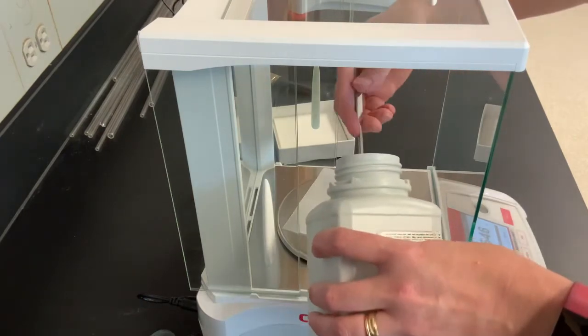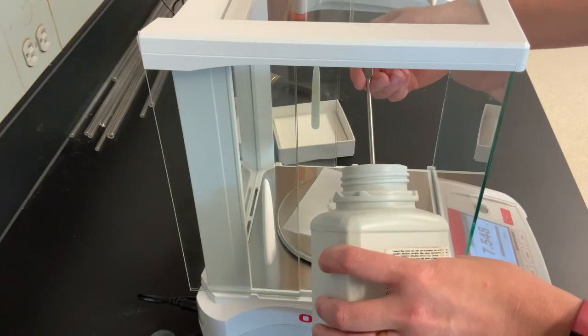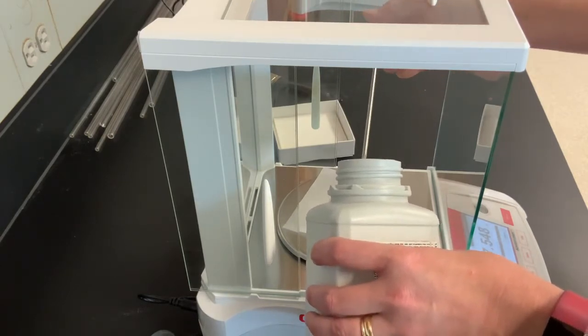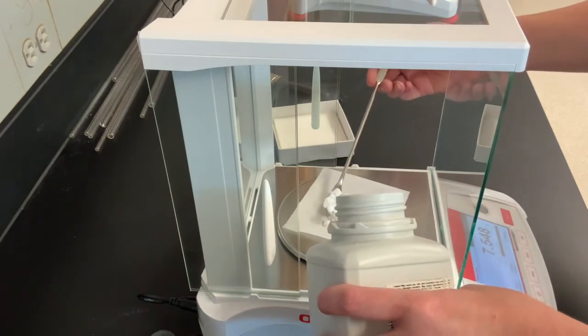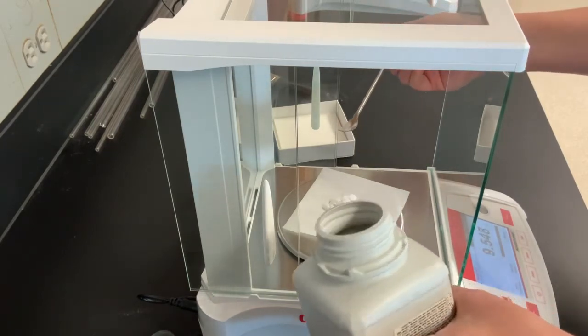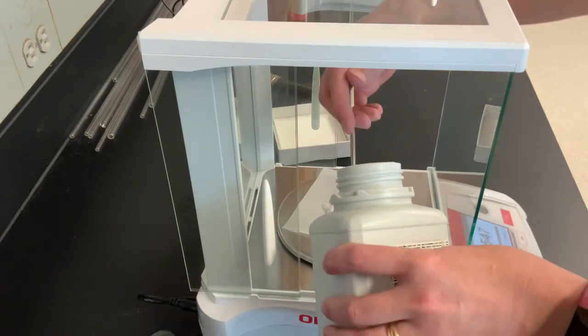When working with sodium hydroxide, we want to be very careful that we don't spill it on the balance. The sodium hydroxide can be very caustic. It can cause lots of rust to the balances and damage our balances. It can also burn our skin, so we want to be very careful.